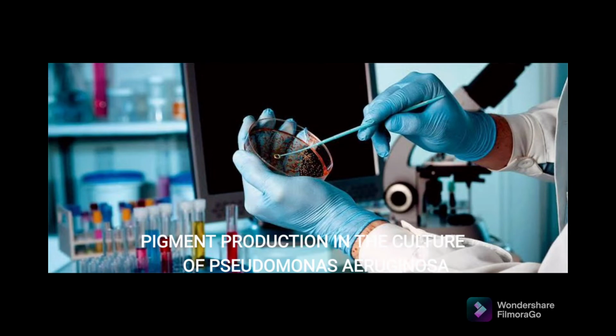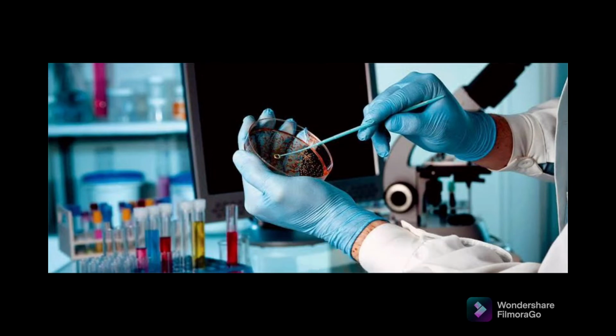In the culture medium, P. aeruginosa produces mainly 4 types of pigments, which diffuse off into the surrounding medium and impart a characteristic color to the medium, indicating the suspected growth of Pseudomonas aeruginosa. These are described as pyocyanin, bluish green; fluorescein, greenish yellow; pyorubin, reddish brown; and pyomelanin, brown to black.